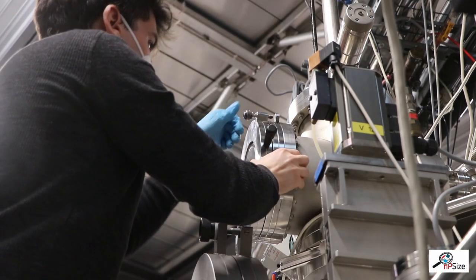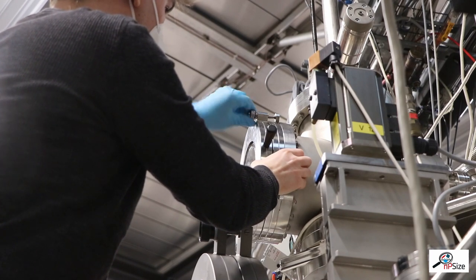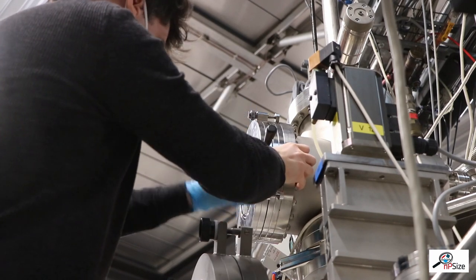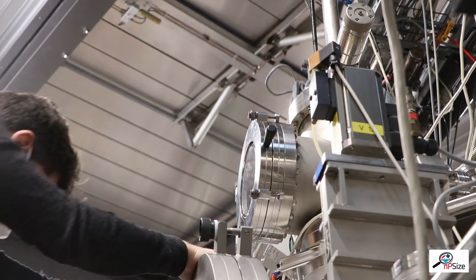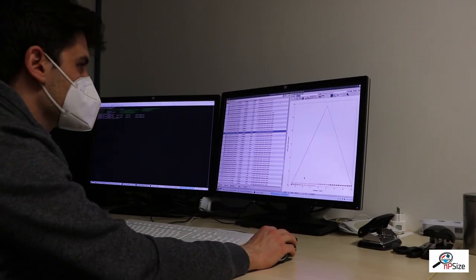After closing the lock, the air is pumped out and the sample is moved to the X-ray beam. Our measurement software allows us to set up an arbitrary sequence of measurements for many different samples.